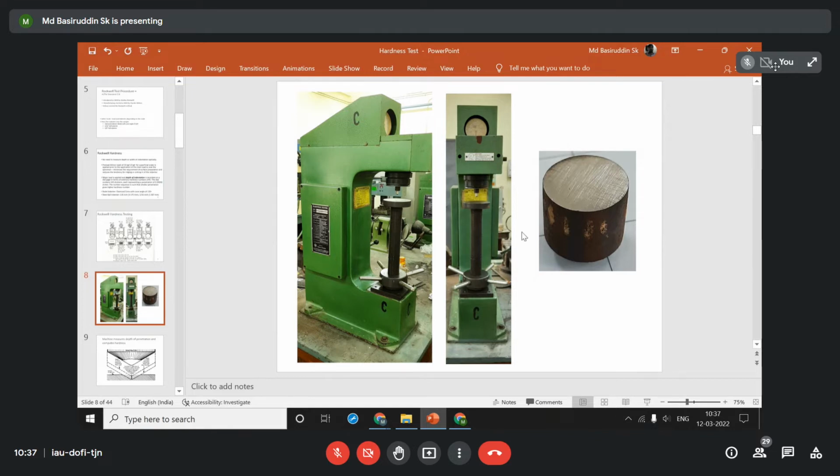During testing, what we always try to focus on is taking the hardness near the center region, because if we take it at the very edge, then maybe the sample will tilt or bend. The sample will tilt, basically.